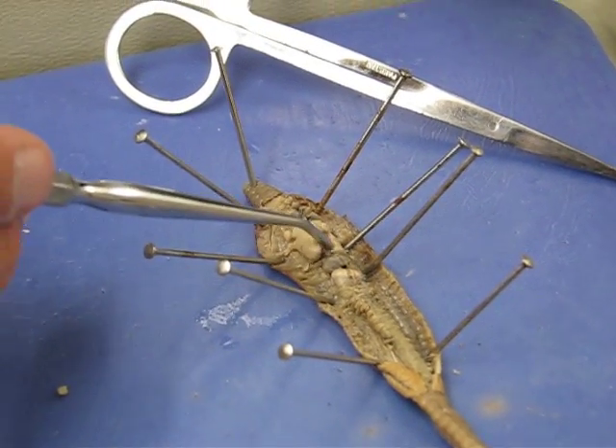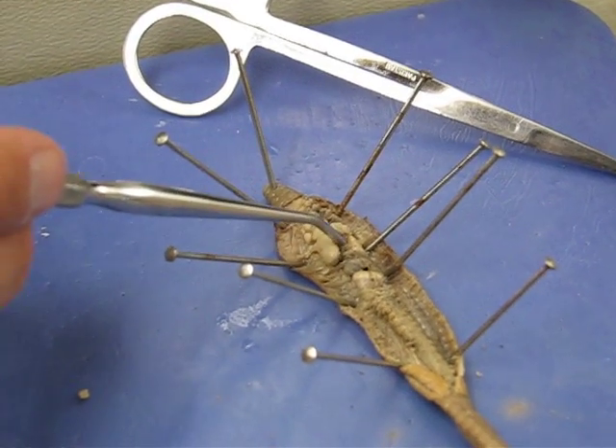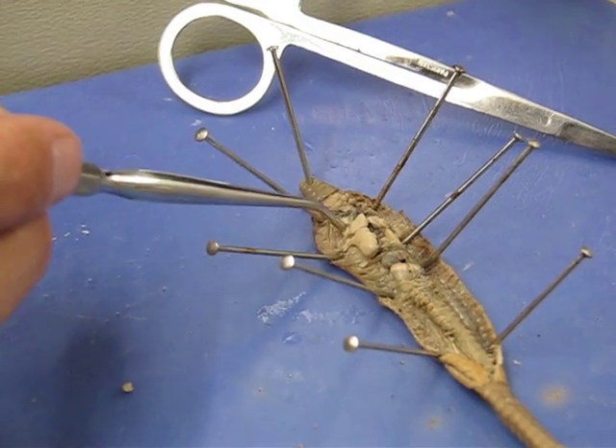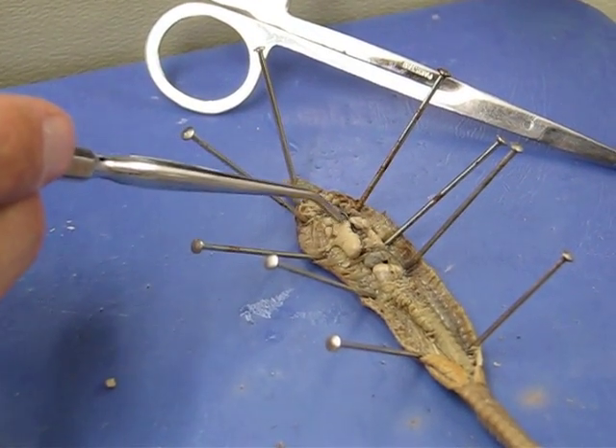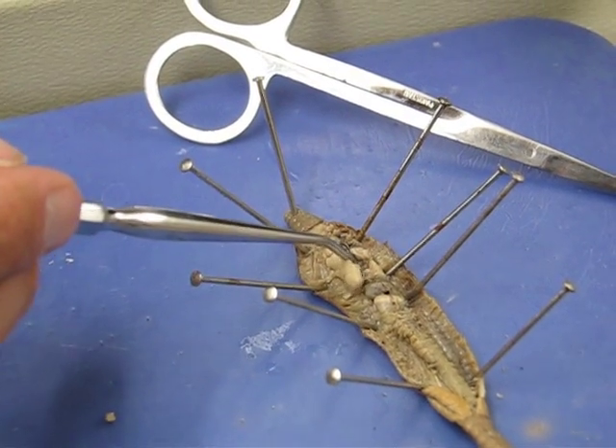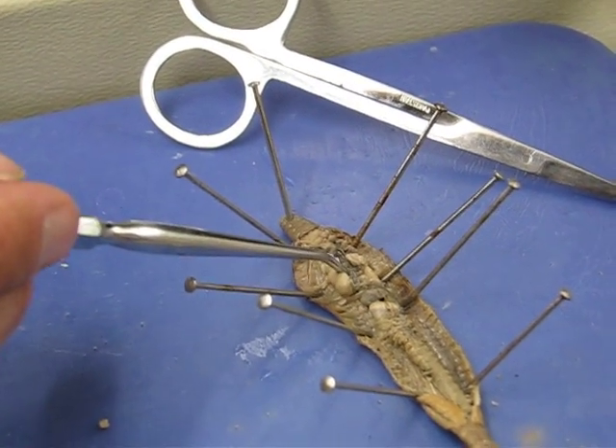These large white structures are the seminal vesicles, and then the smaller ones are the seminal receptacles right there. These little black structures right here are the aortic arches, which are basically the hearts.